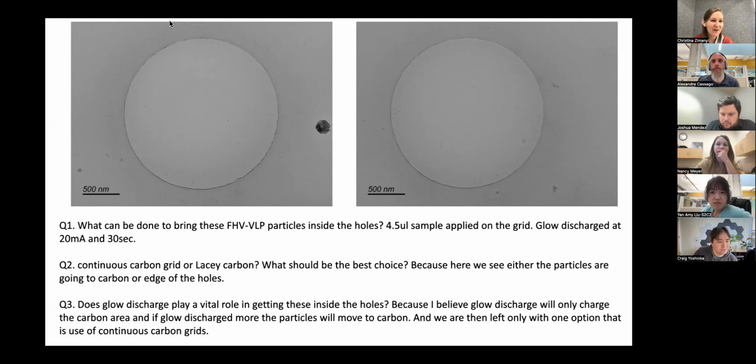Well, thanks, guys. I have to say, whoever submitted this, thank you for picking perfect images where you also looked at the carbon. So many times people don't do that when they don't see particles, and that's really handy. So these were very perfect images for asking this question.